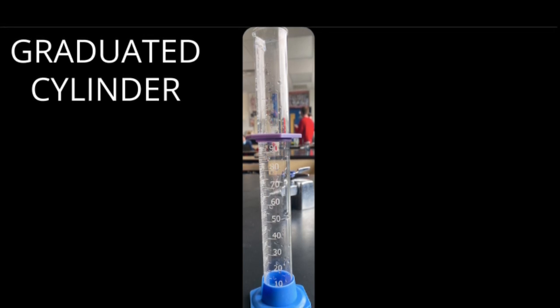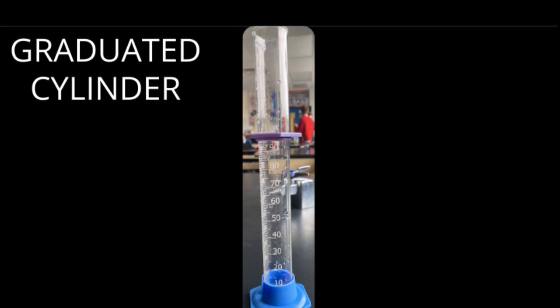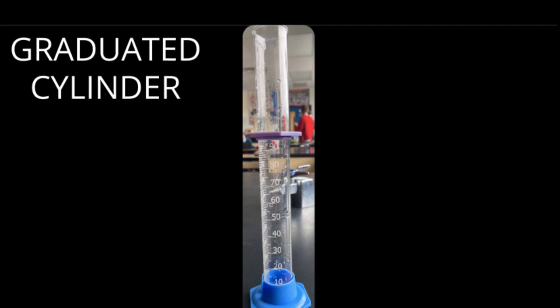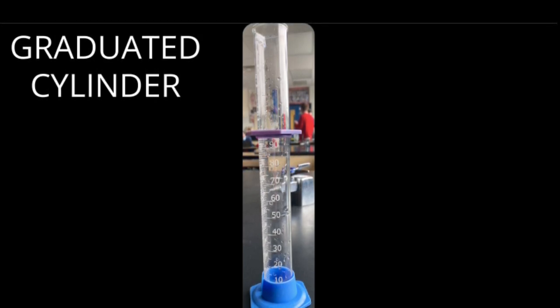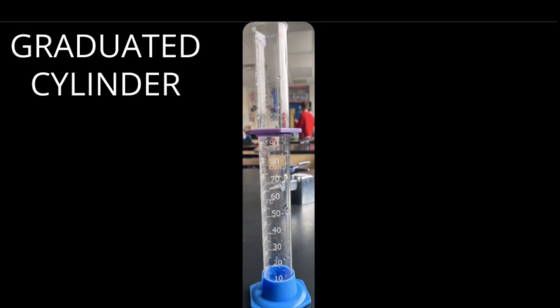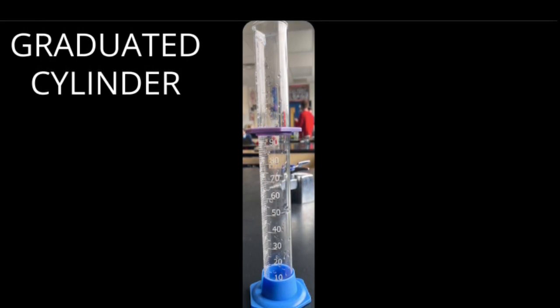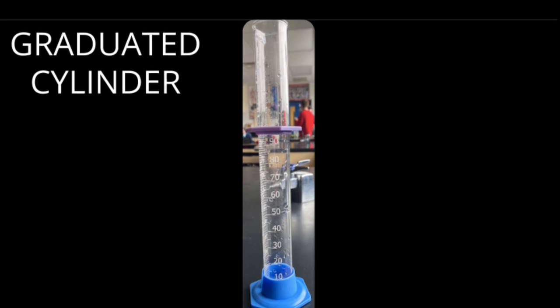Lastly, a graduated cylinder. A single one ranges from six to twenty dollars depending on the quality and volume of liquid held. A graduated cylinder is a piece of equipment that is used to measure volume. It is more precise than a beaker due to the marked incremental graduates on the cylinder. The numbers on the side are more exact and grow by smaller amounts than a beaker making it easier to read.